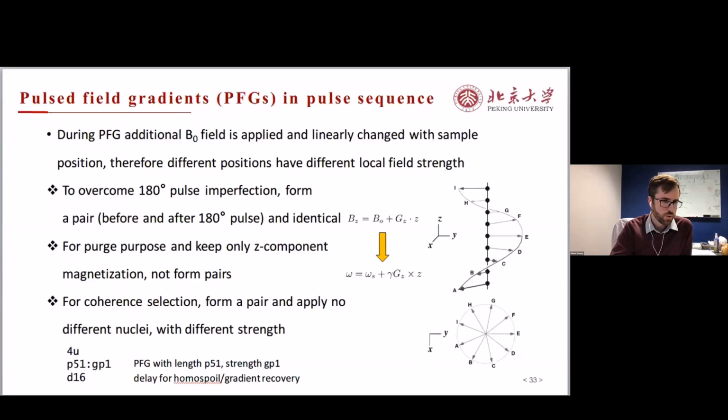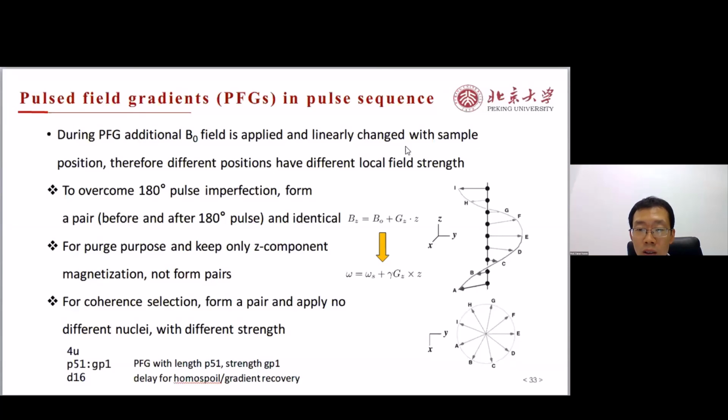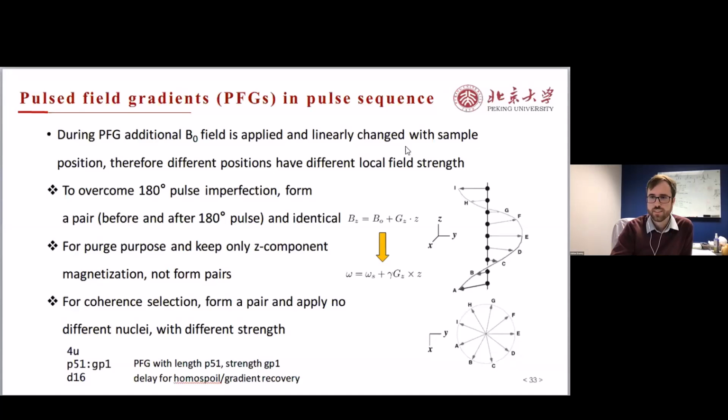If I remember properly, different probes also have different gradient maximums for their gradient channels at times. So it might also be a function of that. Yes, you have to use some standard sample to calibrate the power at 100%. I think it's different from one probe to another.